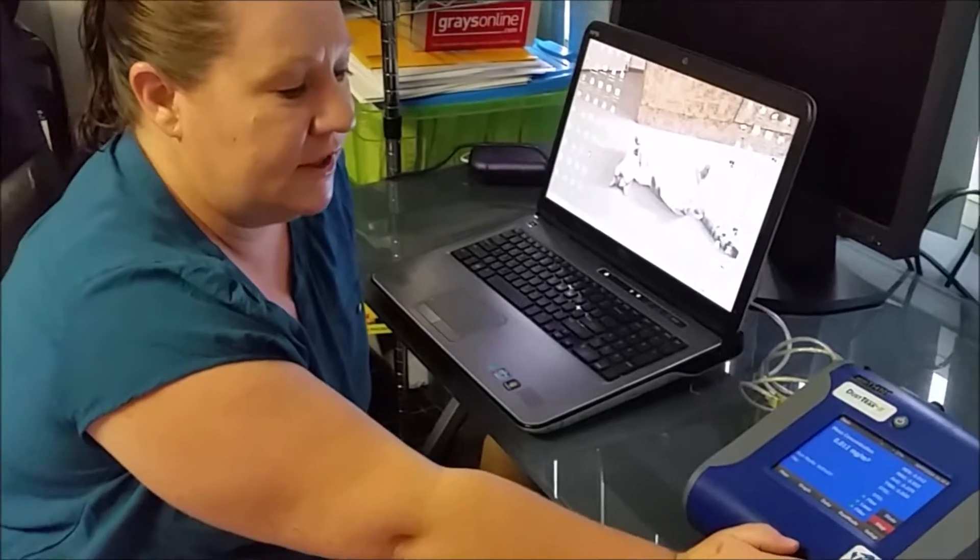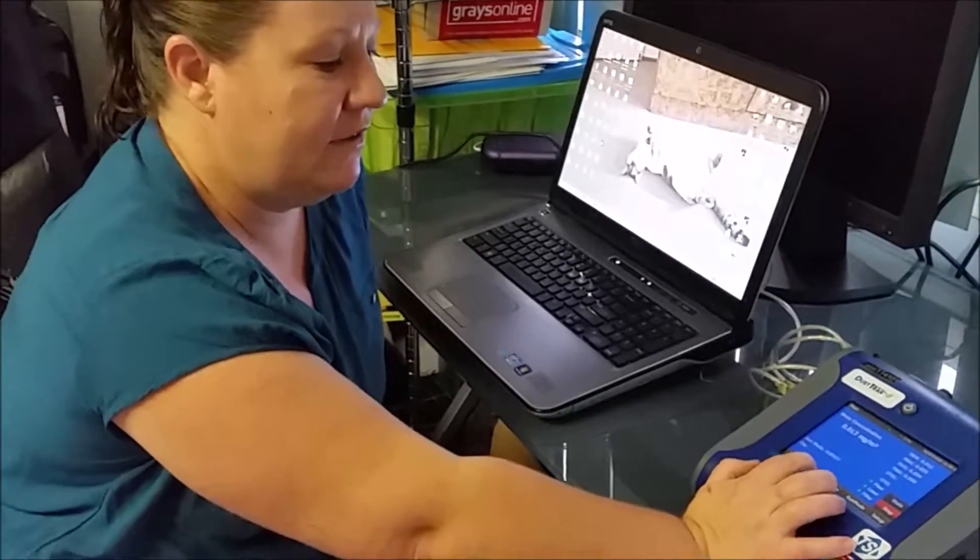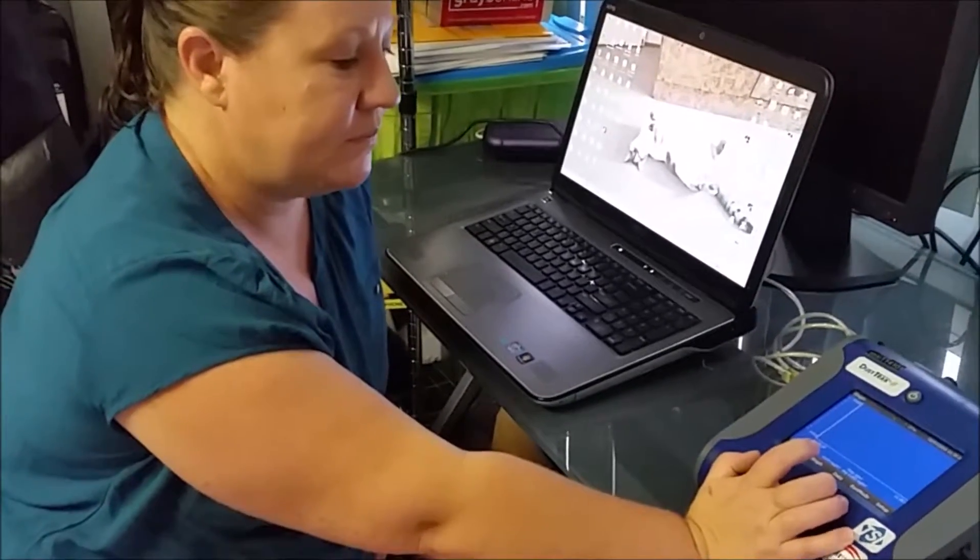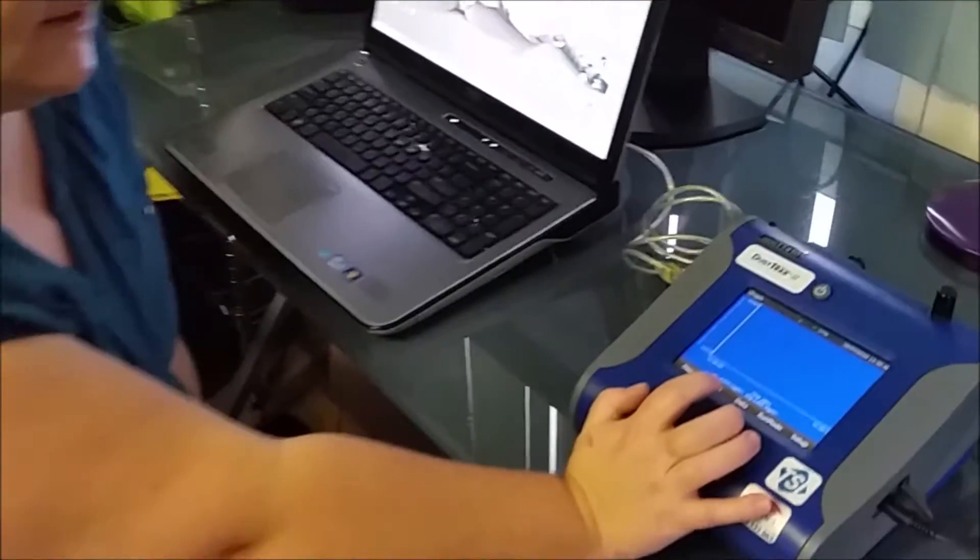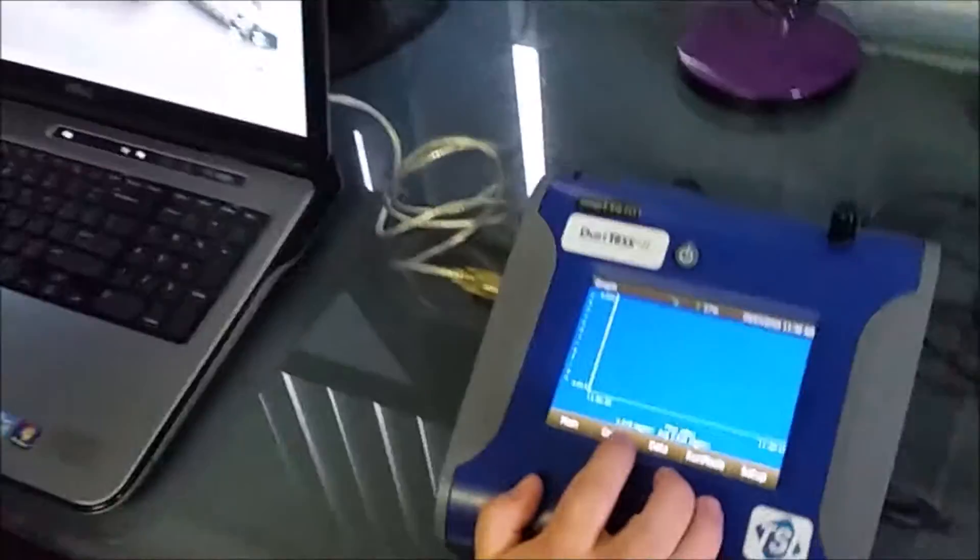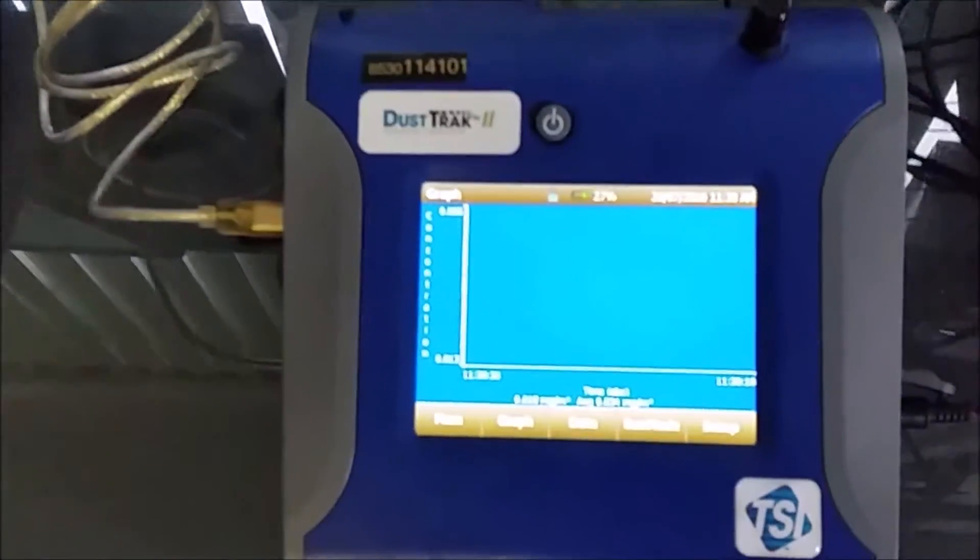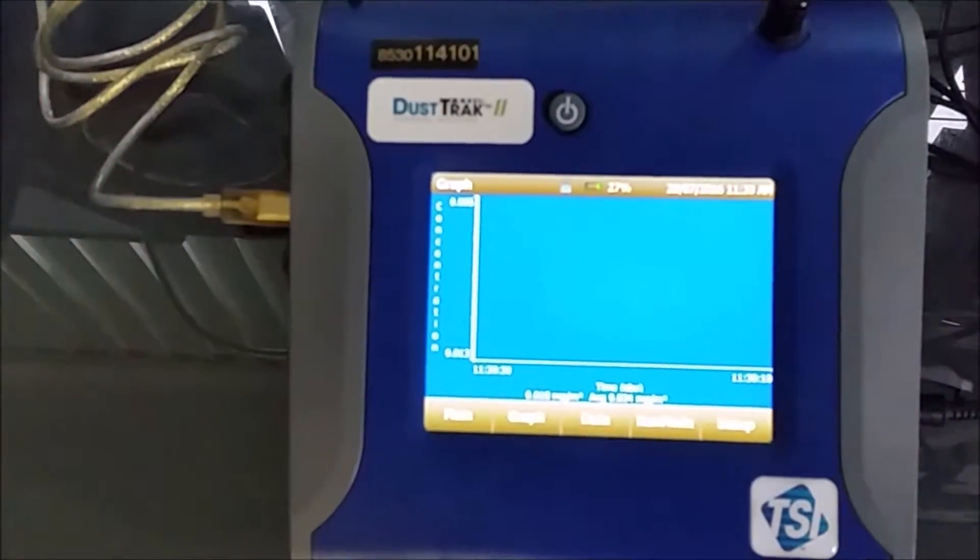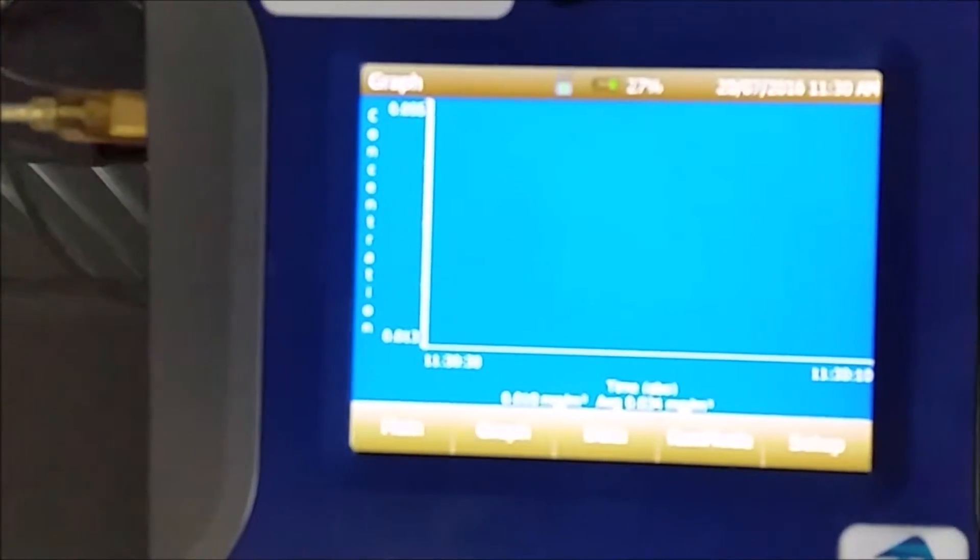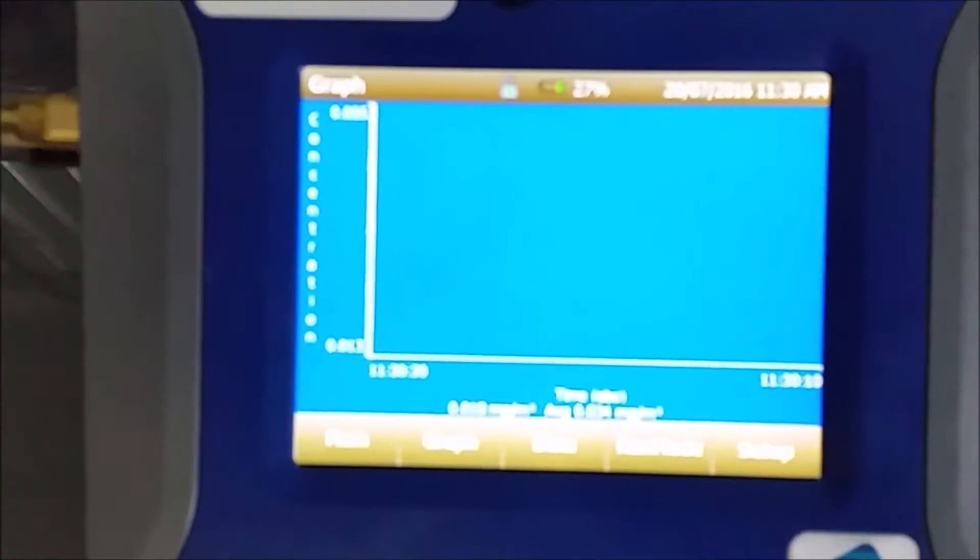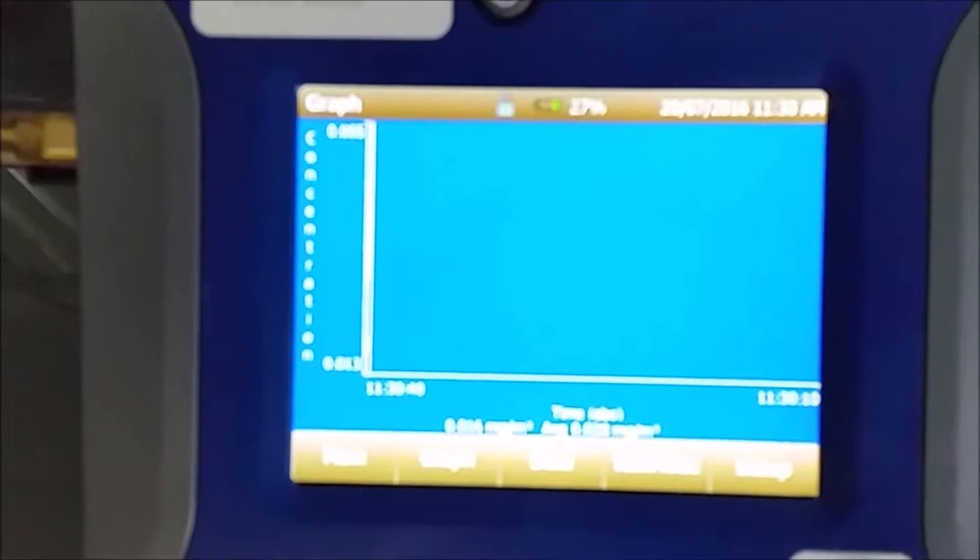With the dust track, you can actually look at the graph as it's taking the samples and it's logging the points of concentration. The concentration is in milligrams per meter cubed.